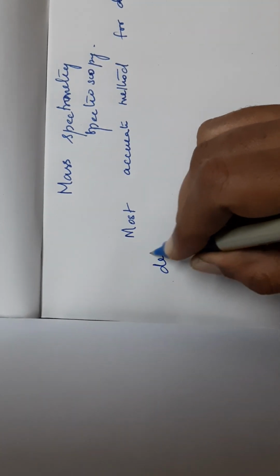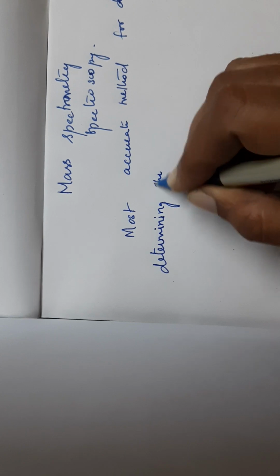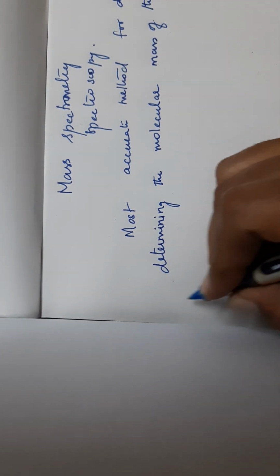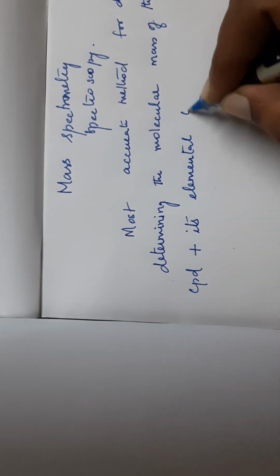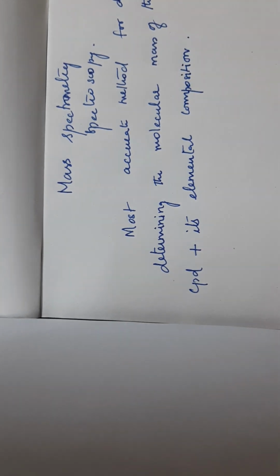for determining the molecular mass of the compound plus its elemental composition. How am I going to find the mass of the compound?